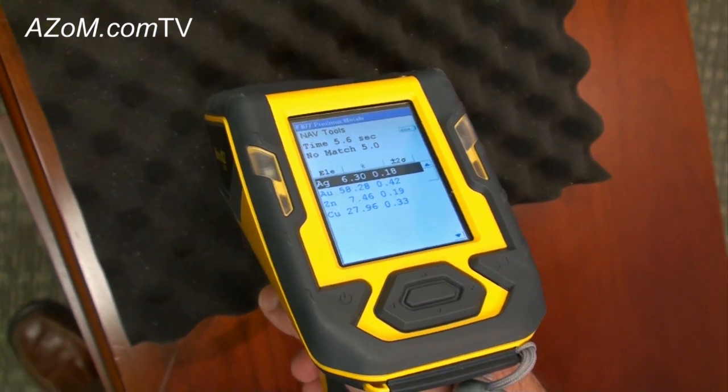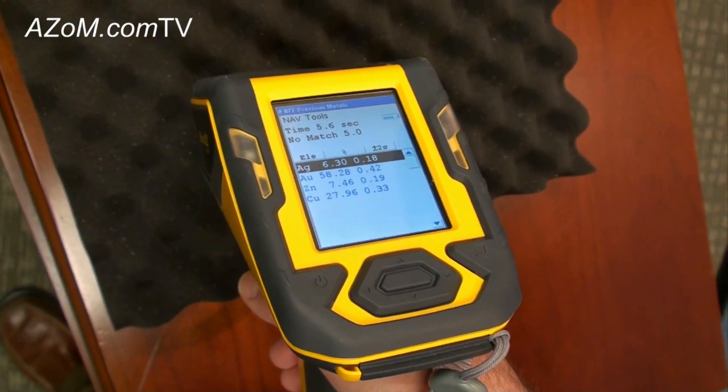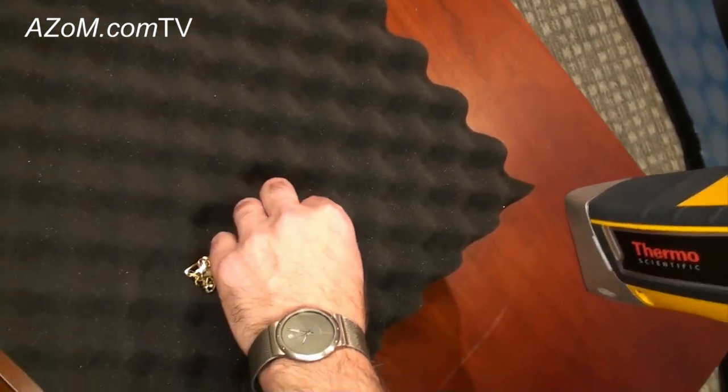We can also see roughly 6% silver as well as zinc and about 28% copper present in the sample. Now let's take a look at this wedding band and see how the results differ.